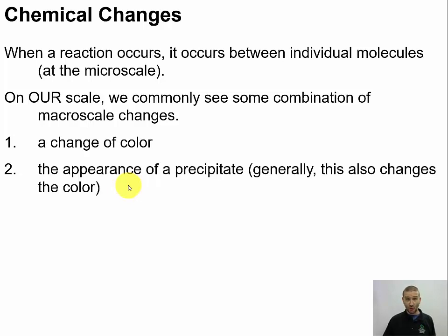Now these crystals of the solid or particles of the solid may be very small and make the solution look cloudy like milk, or they could be fairly large and they settle out as big grains of almost sand-sized crystals, maybe even bigger, right? Typically this will also have an accompanying color change because we change the state of matter, and that often will result in some sort of a color change. We may have the precipitate just turn out to be a milky white color. It could be black. It could be any of the vivid or dull colors that you might expect from any sort of reaction. Remember, all of the particles that you see in paint probably came from some sort of reaction that was a precipitation and gave you those tiny particles sitting in the paint can. So we can definitely have a variety of colors when it comes to the precipitates.